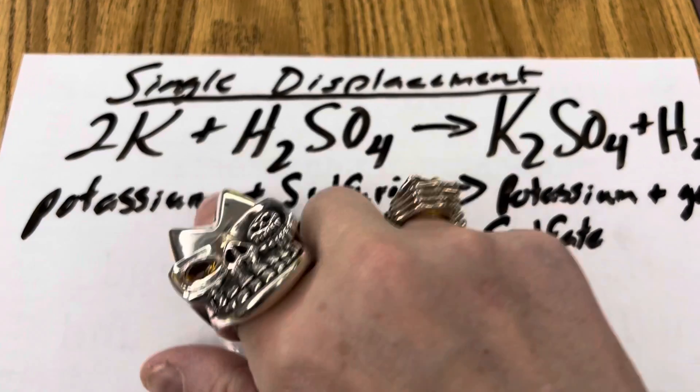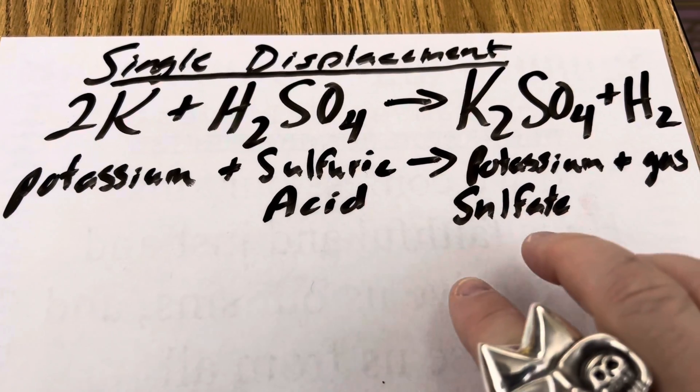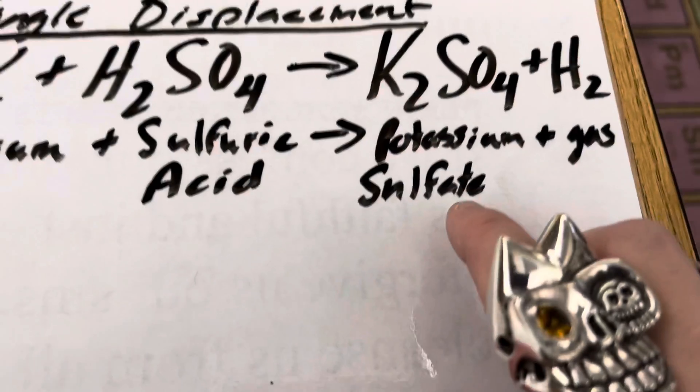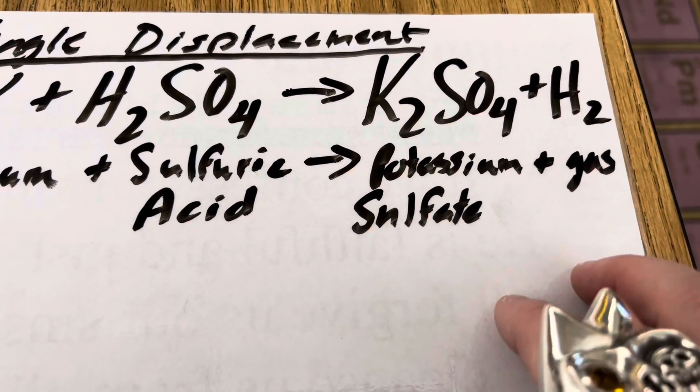In this reaction, the potassium, when combined with the 18 molar sulfuric acid, is going to be displacing that hydrogen and creating potassium sulfate, which is used in fertilizer, and giving off hydrogen gas.